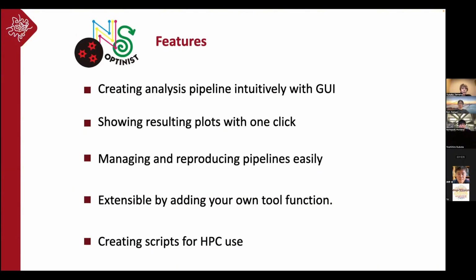OptiNiSt supports creating analysis pipelines intuitively with a GUI and showing results as plots very easily, and managing and reproducing pipelines easily, and it is extensible by adding your own tool functions. Based on these functions, you can create a script for HPC use easily.